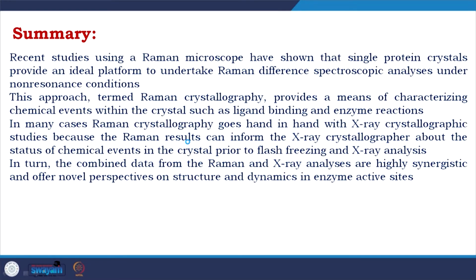But now if you combine them, if you do a Raman crystallography analysis before going for the final data collection, you could actually know whether your drug is there or not, because you see the characteristic spectra of your small molecule in the Raman monochromator. In turn, the combined data from the Raman and X-ray analysis are highly synergistic and offer novel perspectives on structure and dynamics in the enzyme active site.